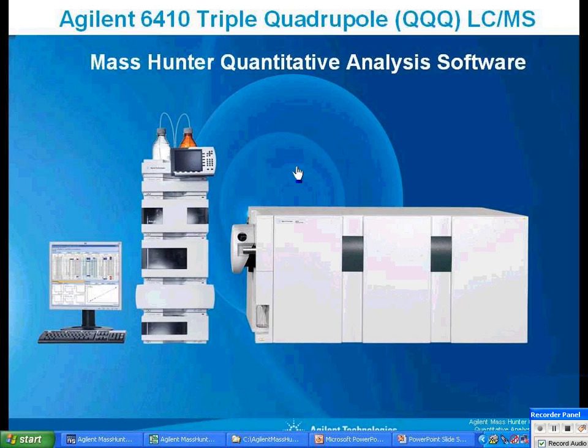Now, before I get started, let me point out that if you already know your MRM transitions, you can use the same methodology to run through a set of permutations, specifically your collision energy and fragmenter voltages, to optimize your MRM transitions.